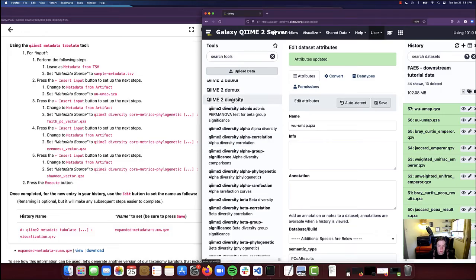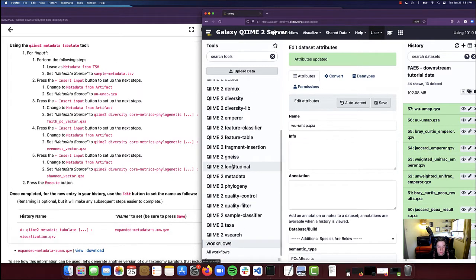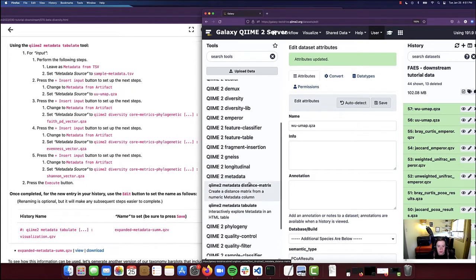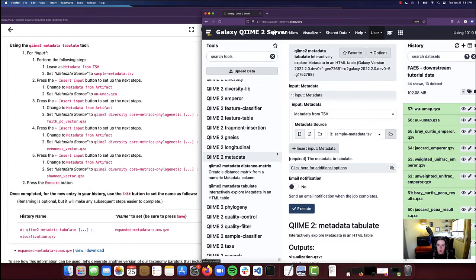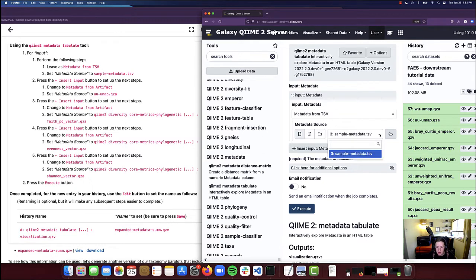This is going to provide us with a few different ways of interpreting these values. I am now going to run QIIME 2 metadata tabulate. I'm going to scroll down to QIIME 2 metadata in Galaxy and click on QIIME 2 metadata tabulate. For our input metadata, we are going to keep this as metadata from TSV, and in our metadata source file we are going to leave this as sample-metadata.tsv.